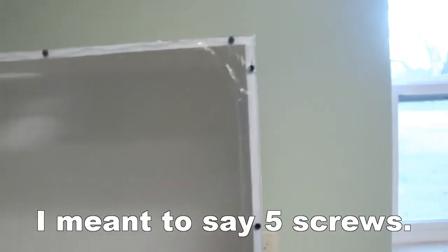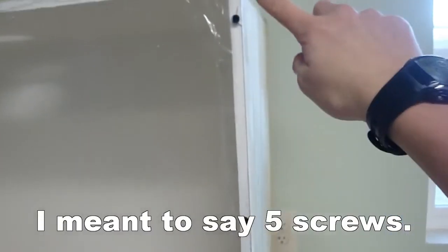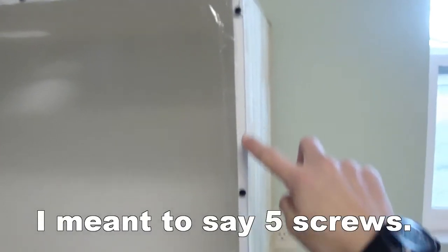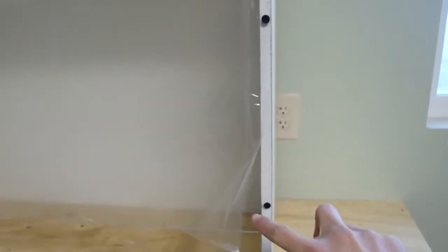So we've got the plexiglass on here. On the sides we have three screws, and on the top we have four screws, and on the other side we have three screws.